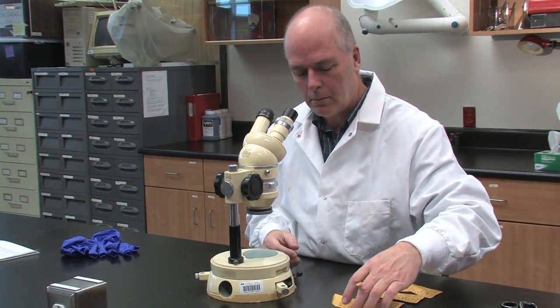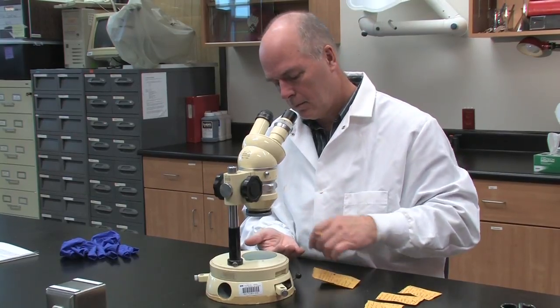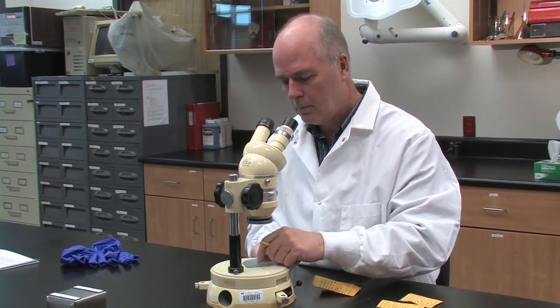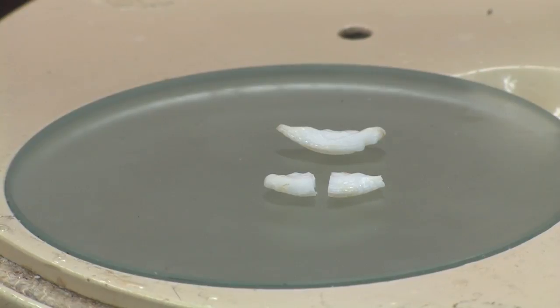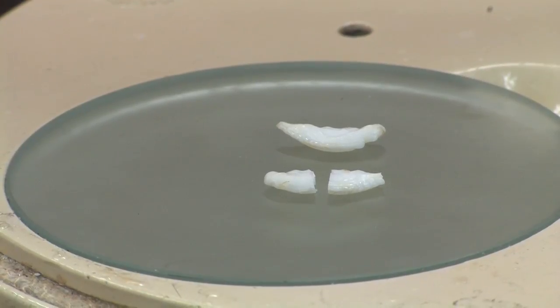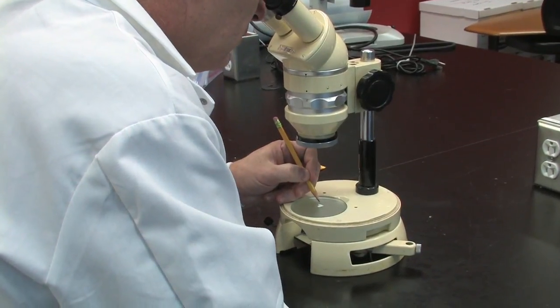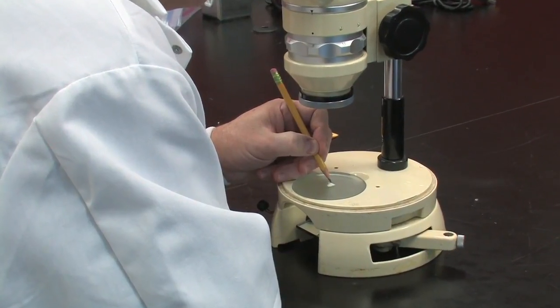You can still use broken otoliths in this embedding process as well. Typically, a break will happen right around the middle, but as long as you can still mark the core, a broken otolith can be put back together and embedded the same way as you would a whole otolith.